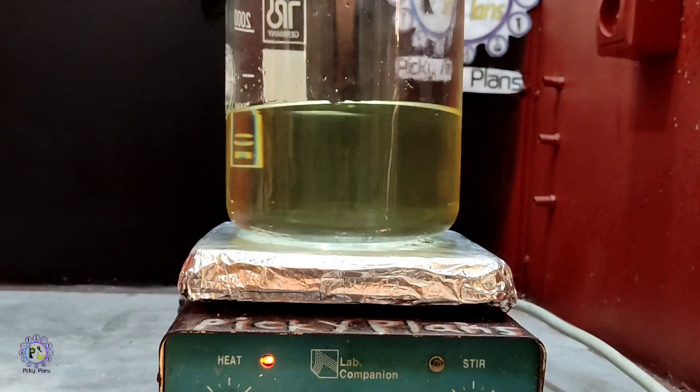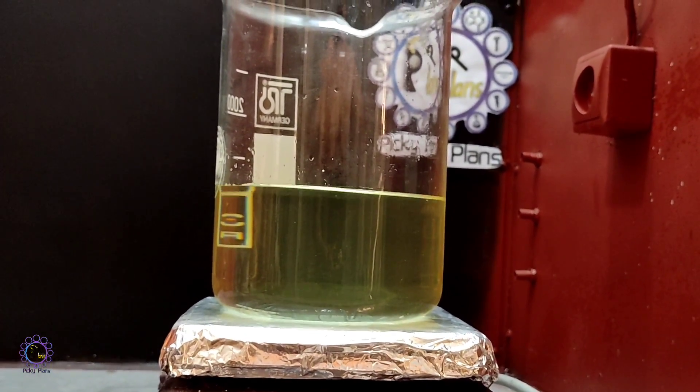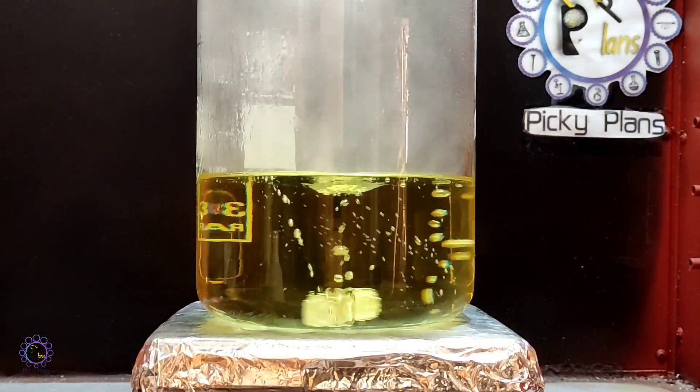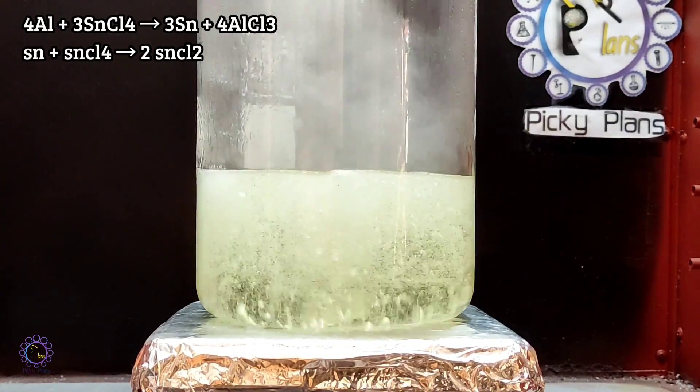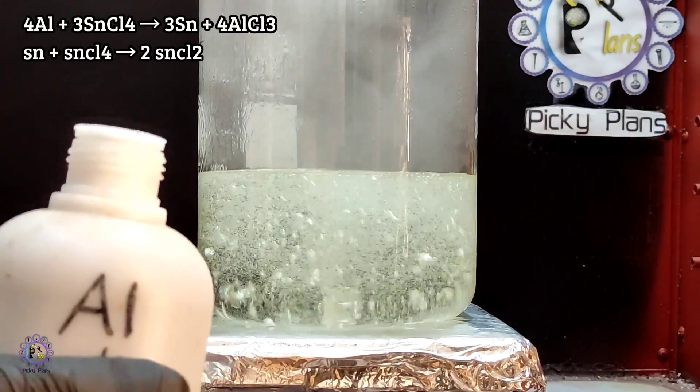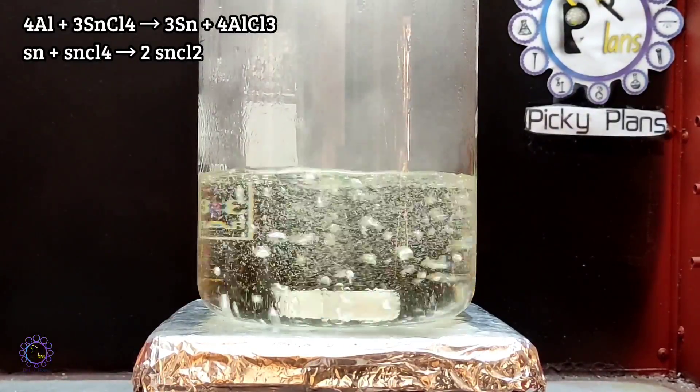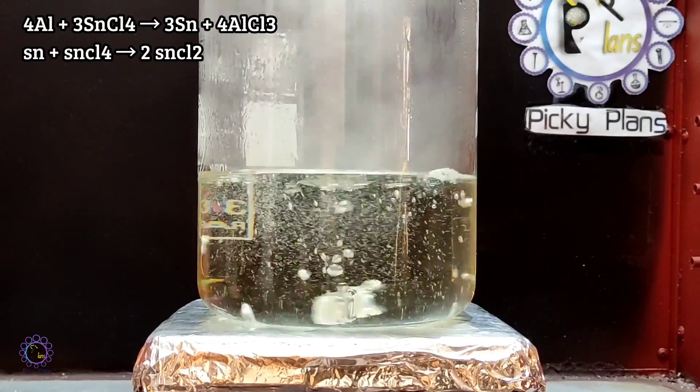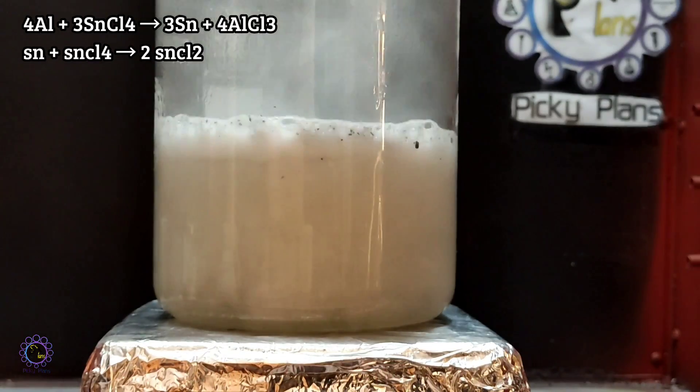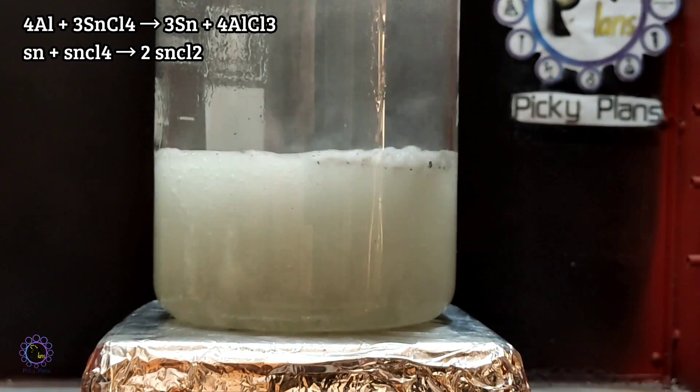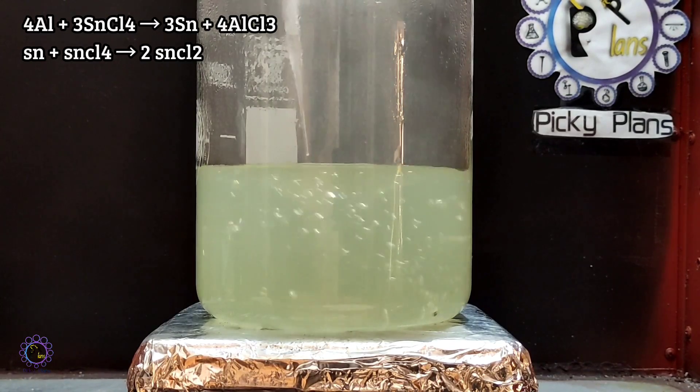Tin metal solution placed on the hot plate to evaporate excess water a bit. To fix solution yellow color and reduce stannic ion back to stannous, some aluminum powder added to the solution. This is the equation that aluminum involves in the reaction in order to reduce stannic ion to stannous. First, aluminum reacts with stannic ion and converts it to metallic tin. Afterwards, tin metal reacts with excess stannic ion in the solution and reduces it back to stannous ion.